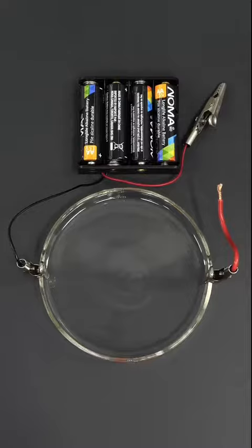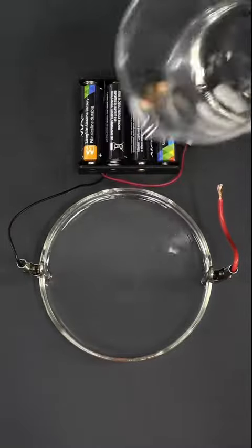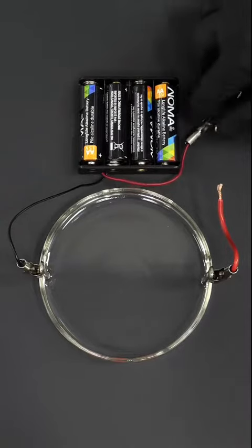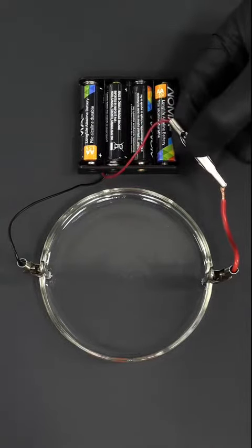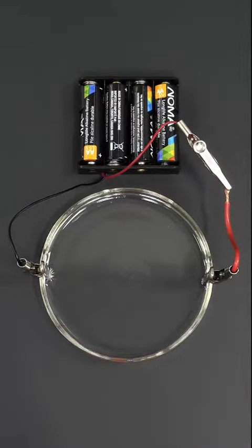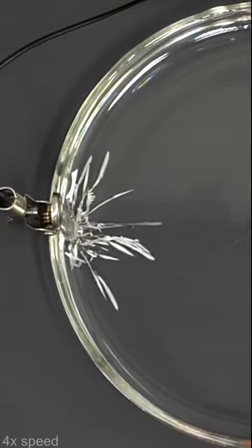I waited for it to cool down, and then I poured some into a small dish that was connected to some batteries. Now to grow the crystals, all I have to do is connect the red wire. Almost immediately, something started growing. This was all tin, and it was forming as some really nice metal crystals.